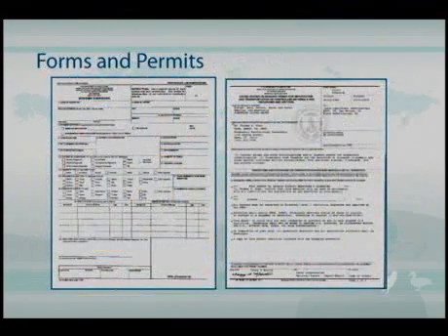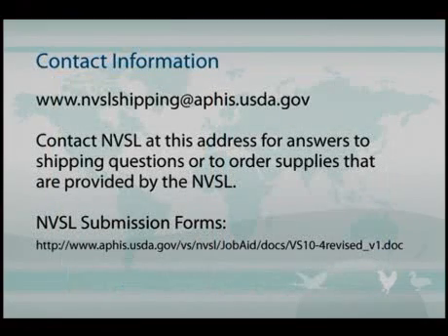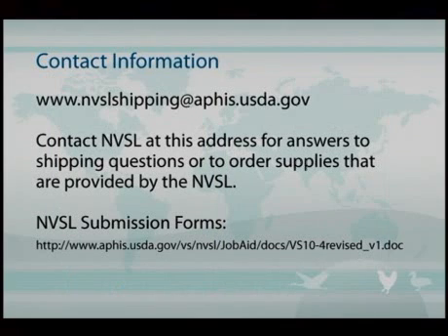Now, these are some examples of the forms and permits that would be required if you're going to submit samples to the National Veterinary Services Lab. Now, if you're using other labs, each of these labs will probably have their own forms and requirements for shipping. So contact these labs prior to your shipping samples to them to make sure that you have the proper documentation. And these are also available on various websites, which I have provided you on the bottom of this particular slide.